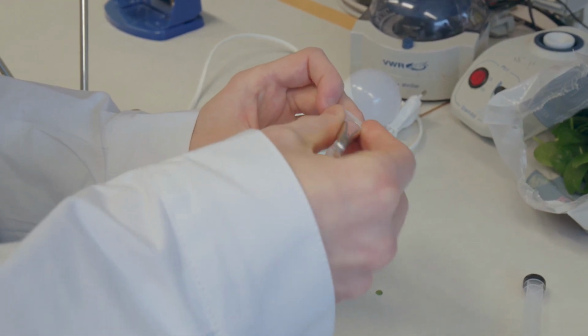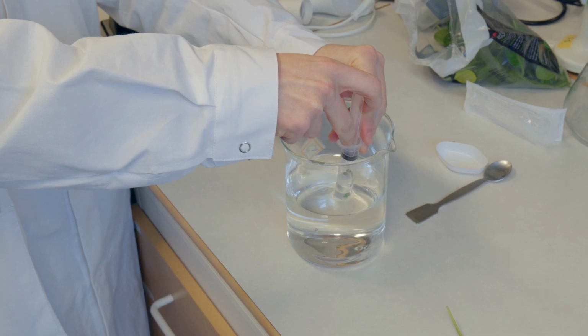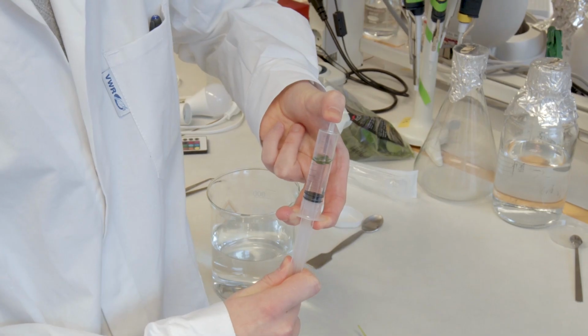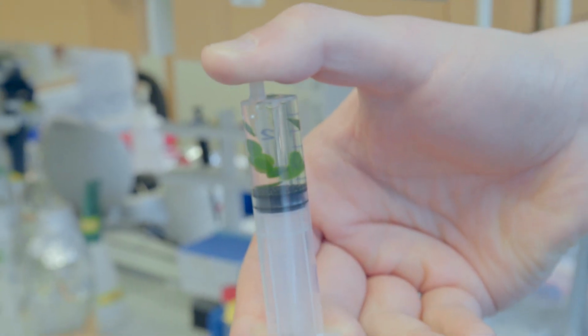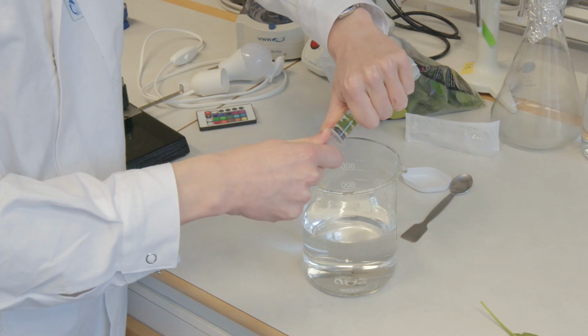We can now put the discs in a syringe together with some of the solution we prepared before. Gently pulling the plunger while holding the thumb against the hole will lower the pressure and pull the air out of the leaf discs, allowing our solution to fill in the gaps and eventually causing the discs to sink.